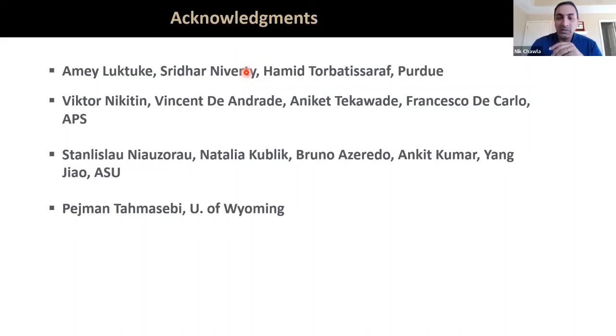So with the recent developments, we're really excited to be able to track a feature automatically, do the image reconstruction and image segmentation, all on the fly while the experiment is developing, while the microstructure is changing.